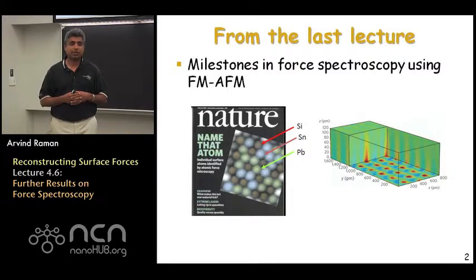high resolution that allow you to actually measure chemical forces between an atom on the tip and an atom on the substrate. Moreover, this capability is now being extended to try and map these interactions in three-dimensional space above a surface, both in surfaces in vacuum, and also in surfaces immersed in liquids these days.